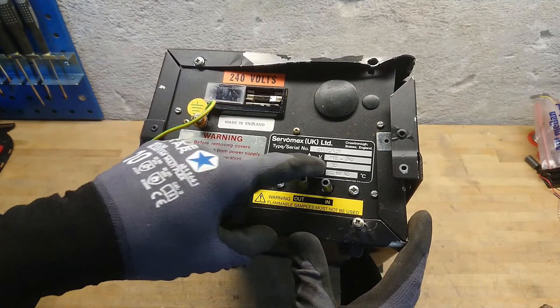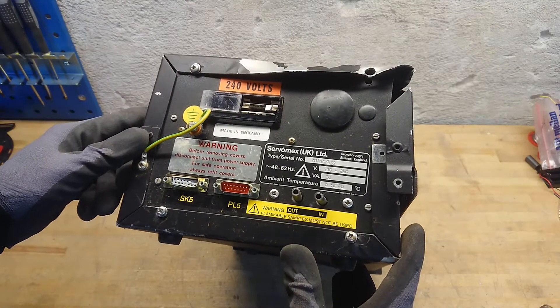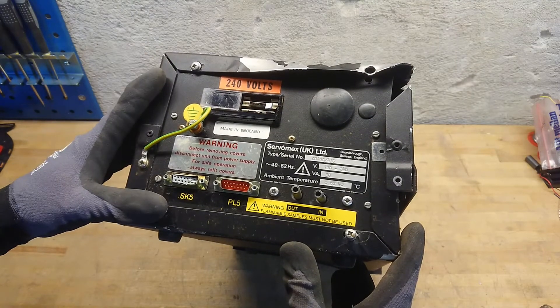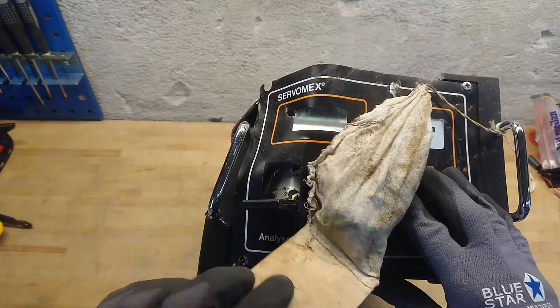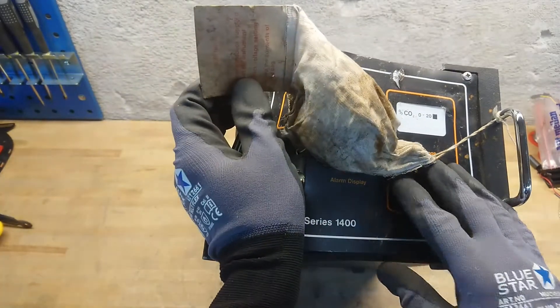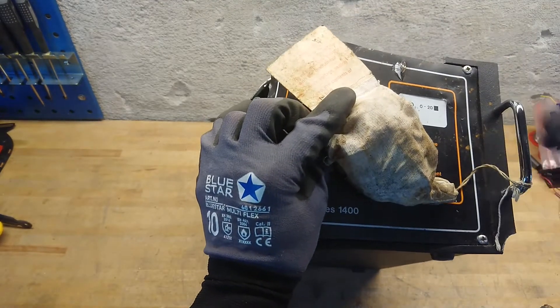It only uses 30 volt-amps, so that's roughly 30 watts. We can clearly say this does not contain anything else than some analyzing logic — there is no heating element or Peltier freezer or anything like that. There was this mystery bag at the front, which makes me think it's some kind of spare part bag. Maybe this unit was actually never used and just thrown out directly from the shelf.